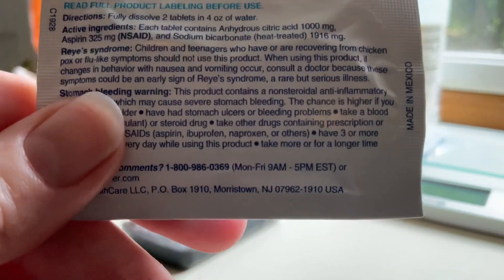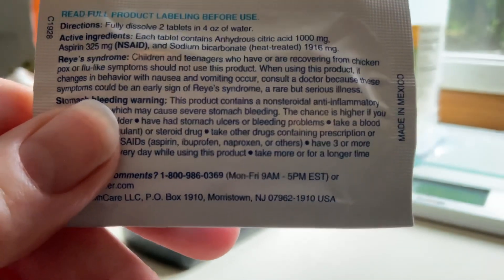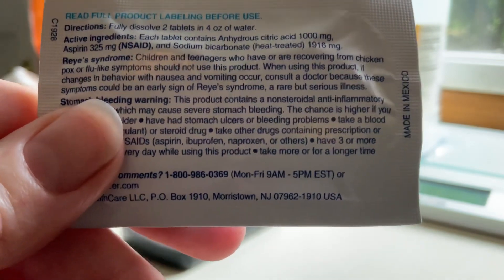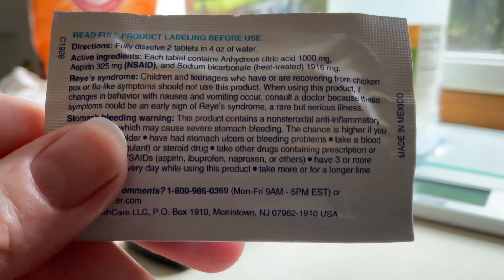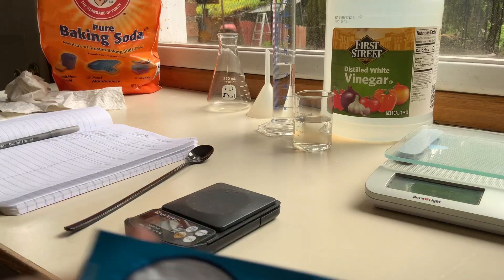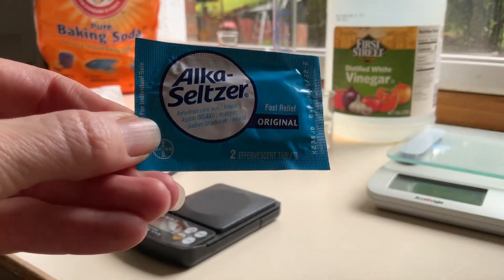I'm starting Part B of the Stoichiometry Lab for Chem 121. Look over on the upper right side — you can see the claim on the label: sodium bicarbonate 1916 milligrams. That is the claim of how much baking soda is in this set of Alka-Seltzer tablets.